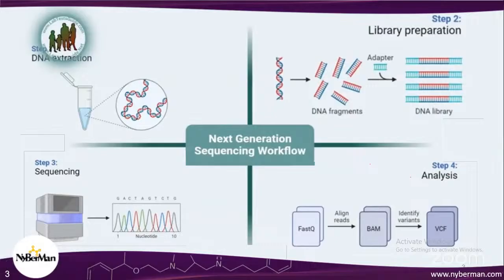Because when DNA is inside your body, it is in a stable form, but when it is extracted outside and in the lab, in petri dishes, it may go into an unstable stage. So to stabilize those sequences, so that we can capture their expression values clearly and accurately, we stabilize them by adding adapter sequences and poly A sequences to the DNA sequences that we have fragmented. After that step, we have the next step, which is the sequencing step.